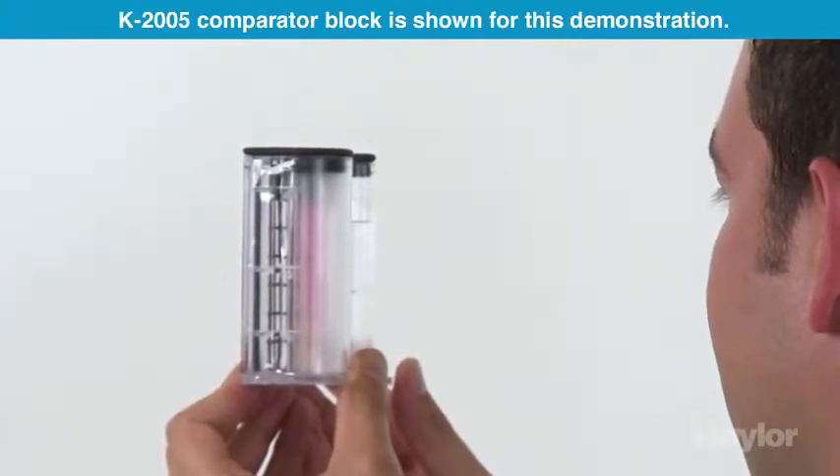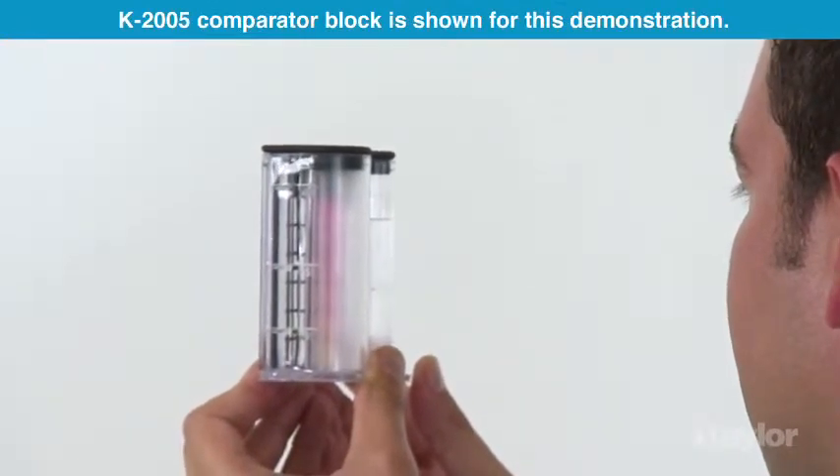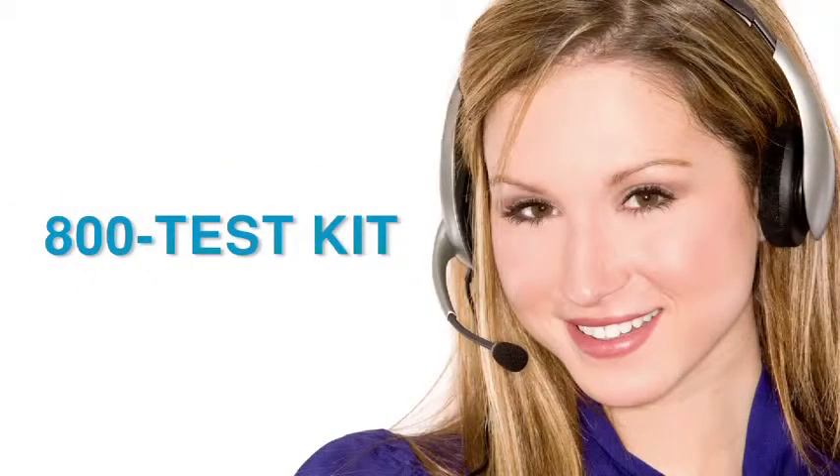Record the reading as parts per million cyanuric acid. Taylor's knowledgeable customer service representatives are available to provide technical assistance about our products. Call 800-TEST-KIT.